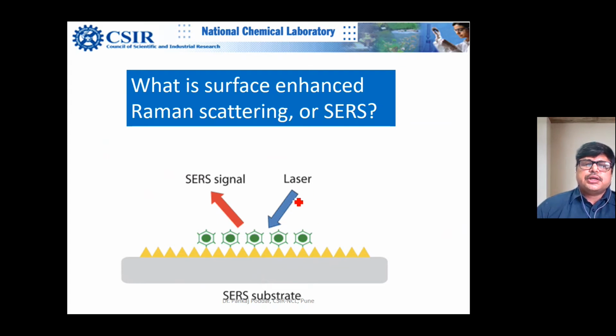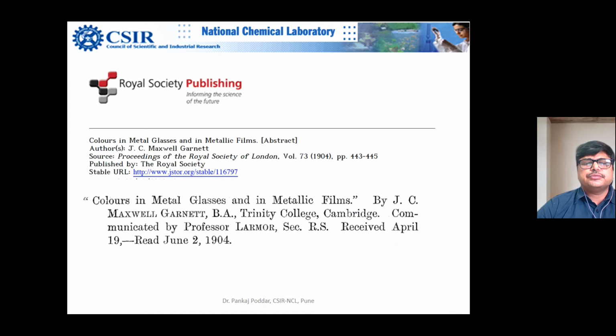Once you align the laser frequency with the surface plasmon resonance frequency, then you see the maximum enhancement in the signal. It is a very powerful technique. You saw from the table earlier that the Raman scattering cross section is many times higher than in any other Raman technique actually. So this is what we do in our lab, and we have published several highly cited papers using this technique for various systems. For lack of time, I may not be able to show them.